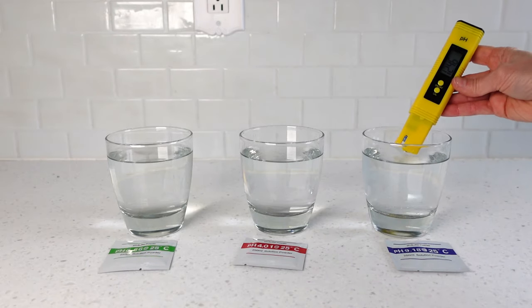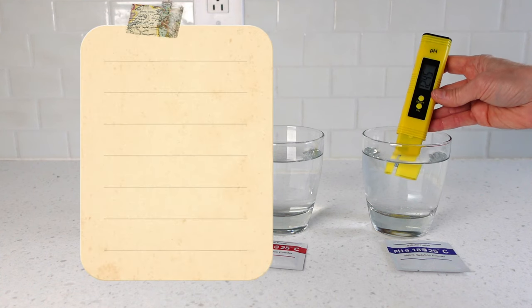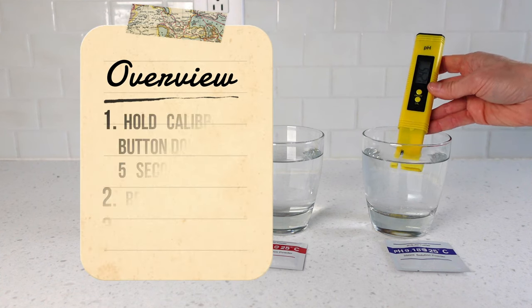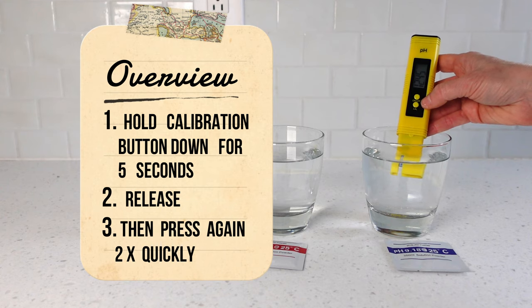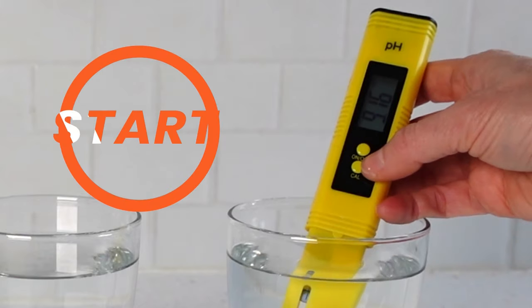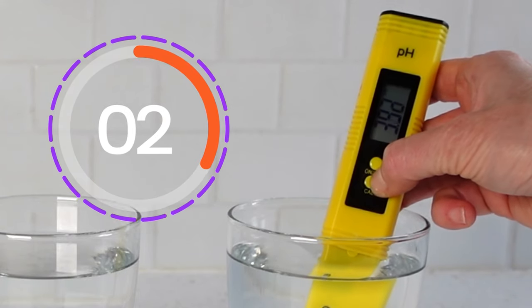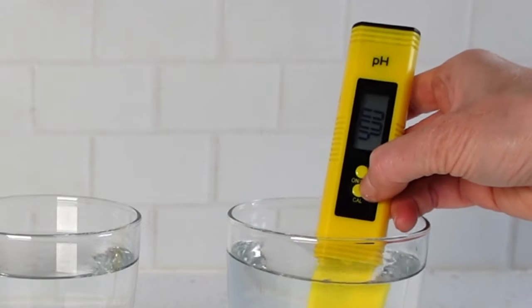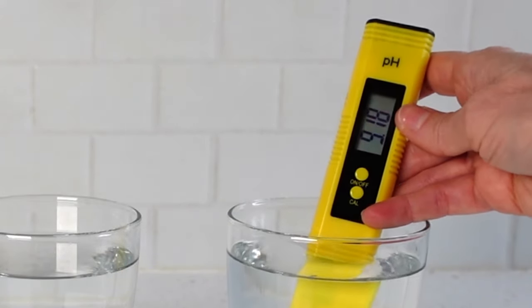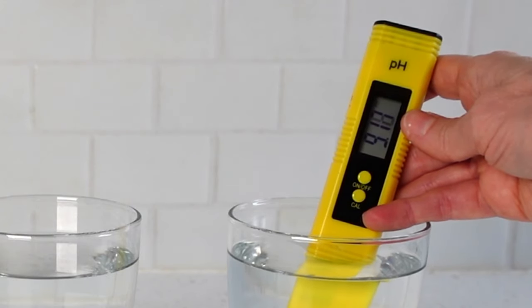Place the meter into the water and if needed, turn it on. Hold the calibration button down for five seconds, then release and press two more times quickly. Wait for the meter to start and stop flashing. Calibration number three is now complete.